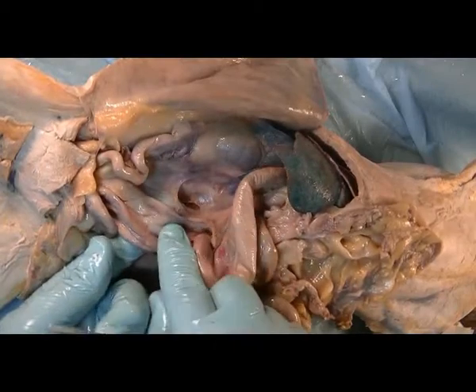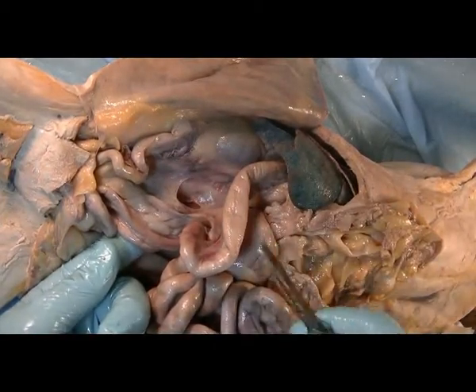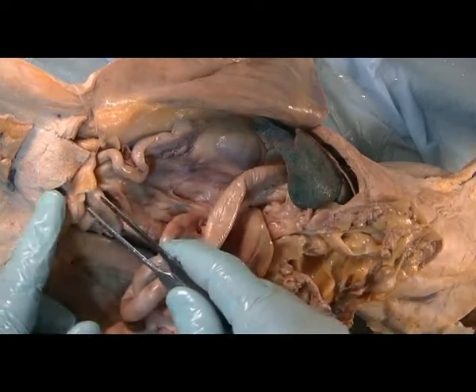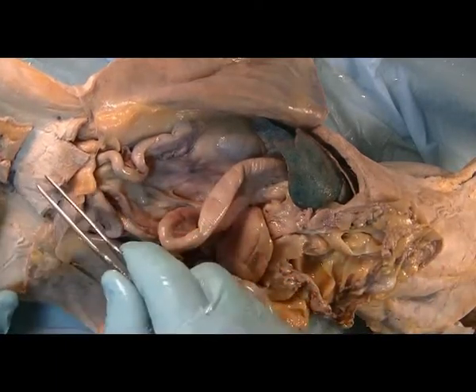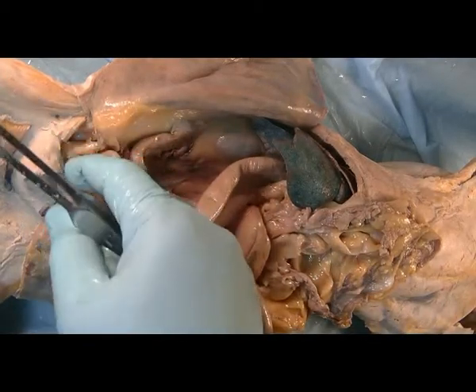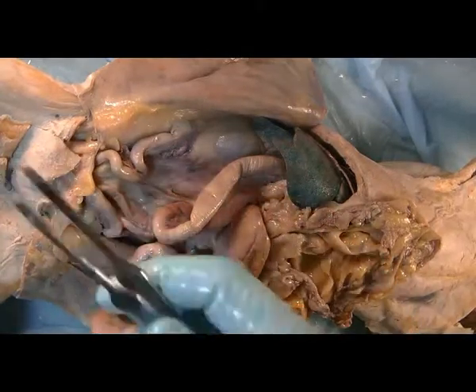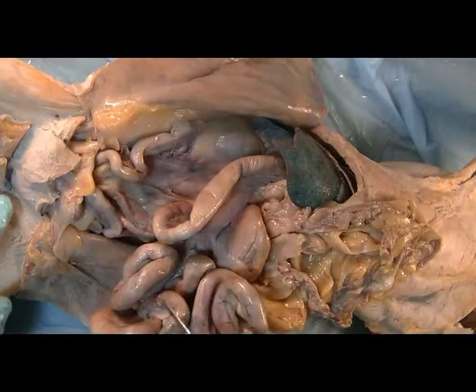That's anchoring the colon to the dorsal wall. That's the mesocolon. There's a mesorectum also, but the rectum is hidden in here, which we don't dissect, and it's hard to see. Just know that that's another mesentery that you have to be aware of.